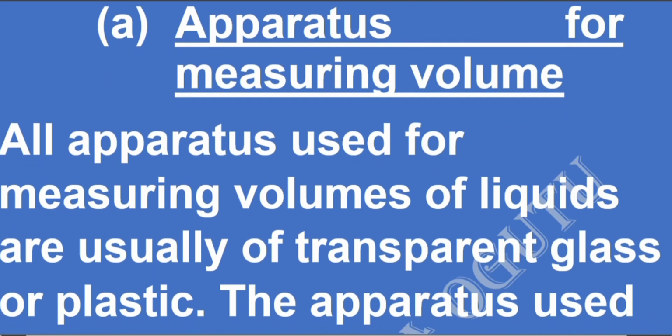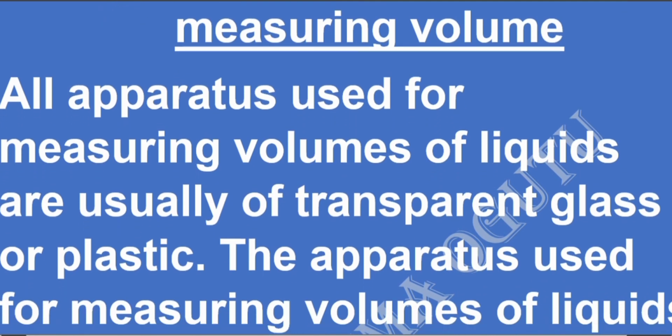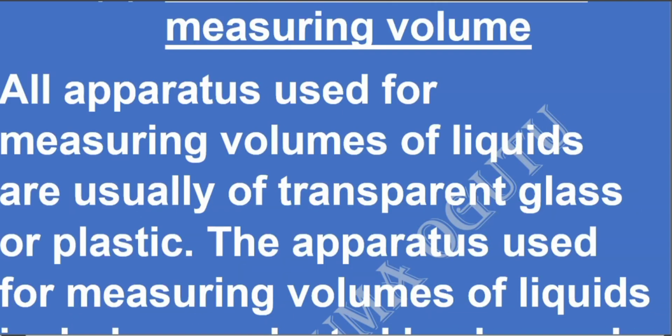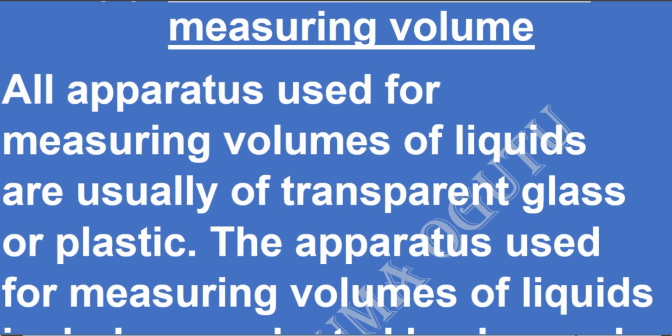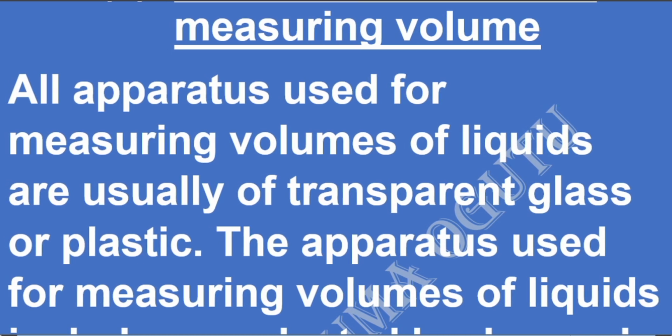So the apparatus used for measuring volume of liquids, you're saying that they are transparent, either glass or plastic.